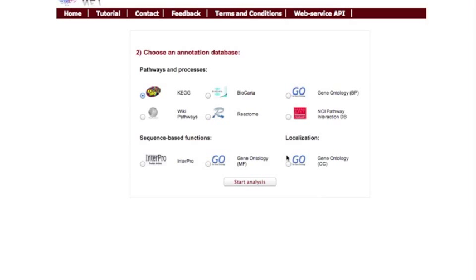Now you can choose a collection of cellular pathway definitions that you would like to compare against your gene set. For example, Biocarta.